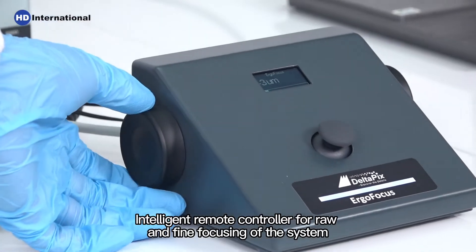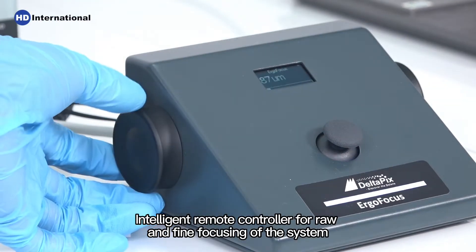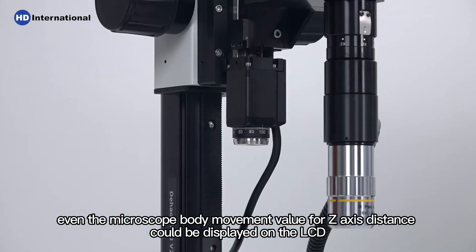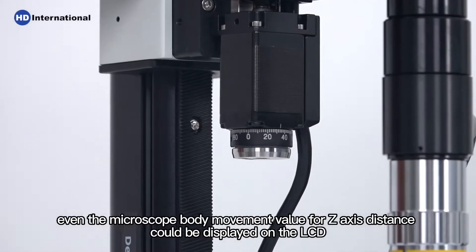An intelligent remote controller allows for coarse and fine focusing of the system. The microscope body movement value for Z-axis distance can be displayed on the LCD.